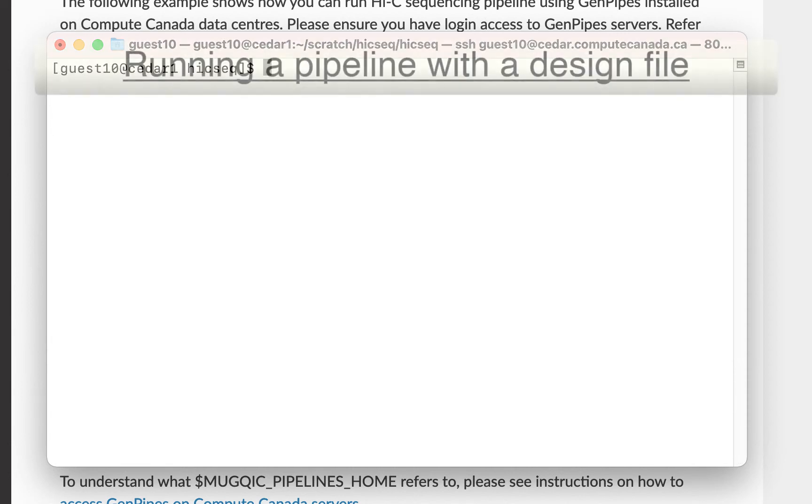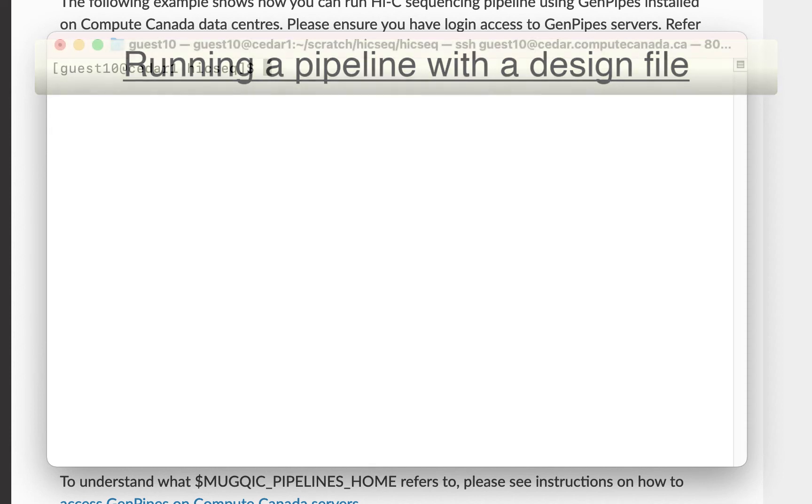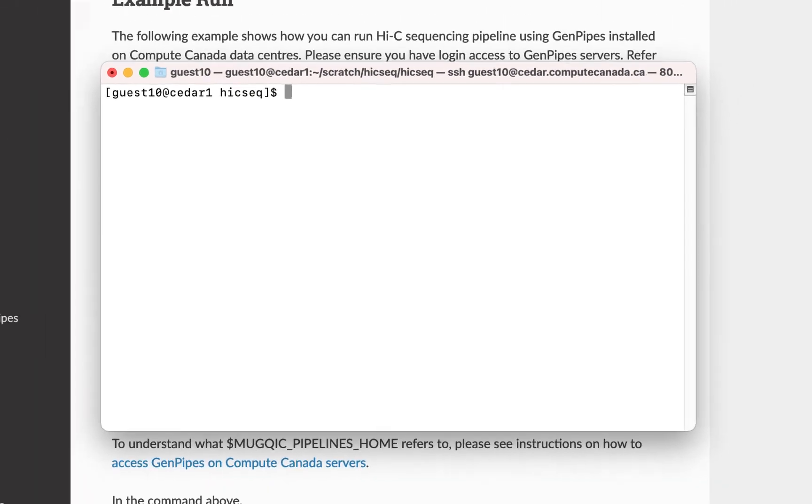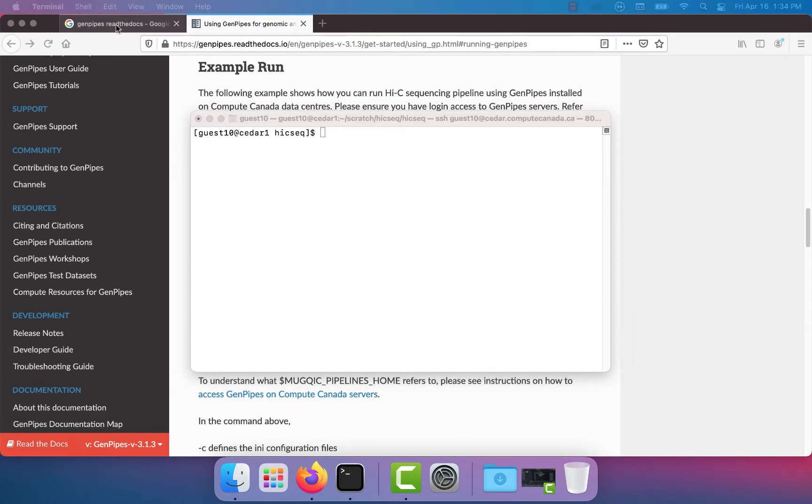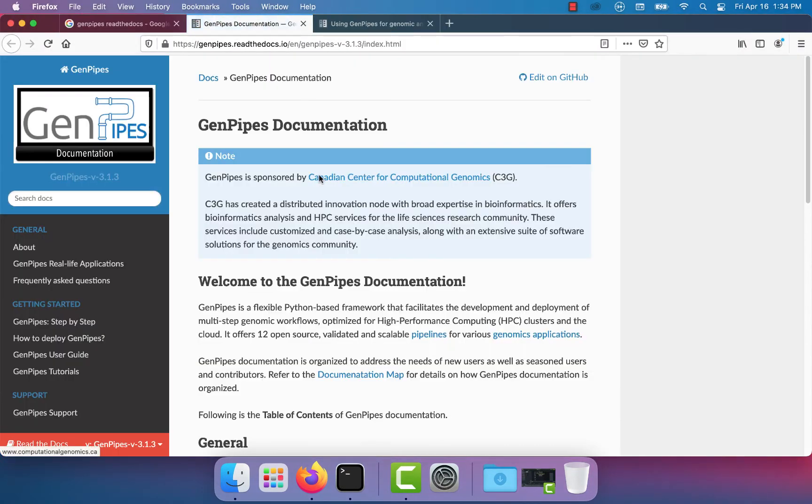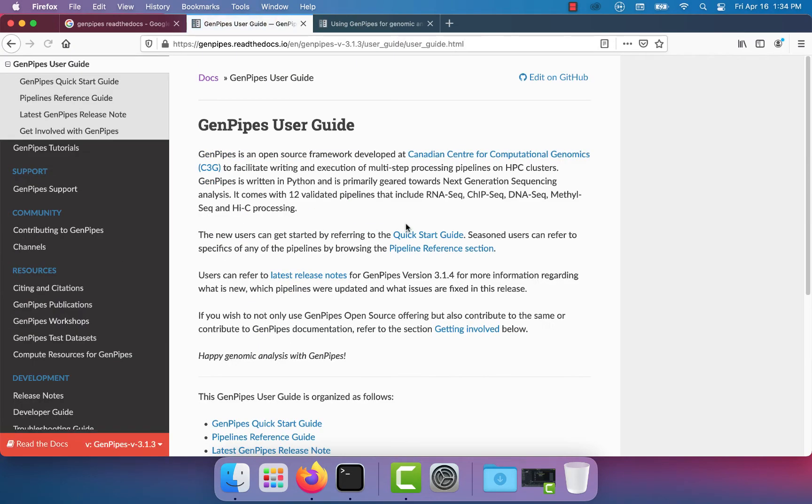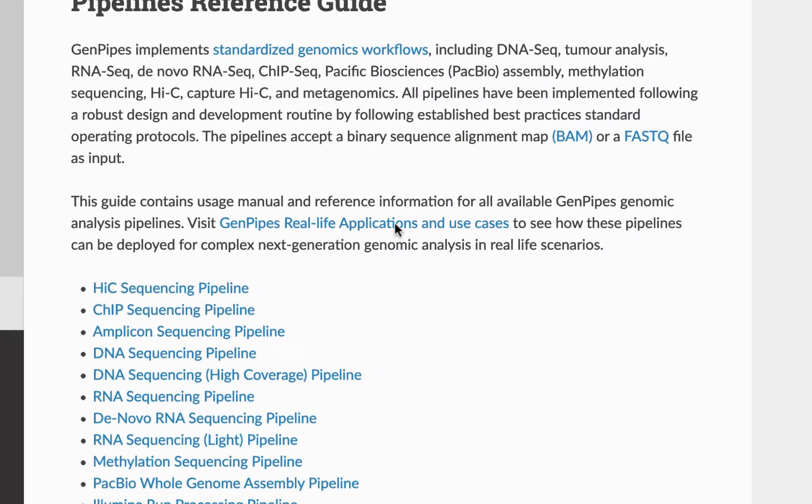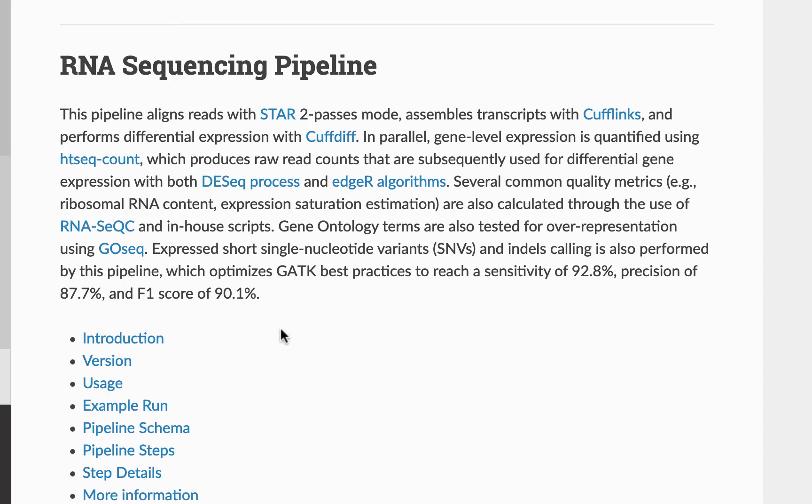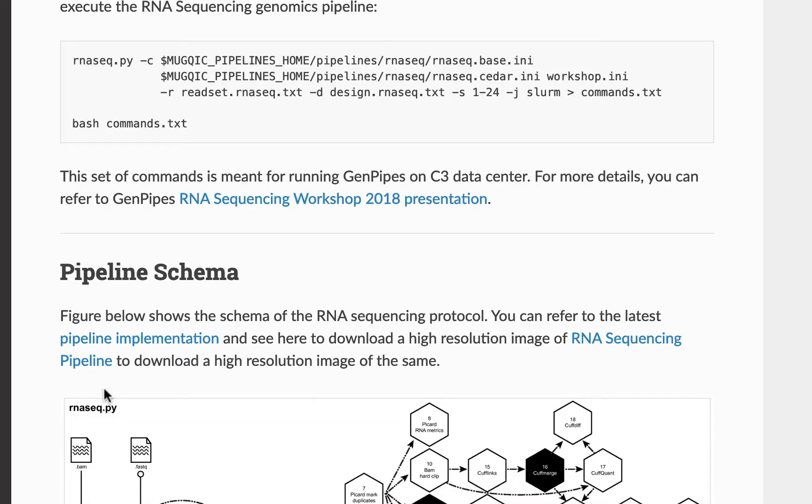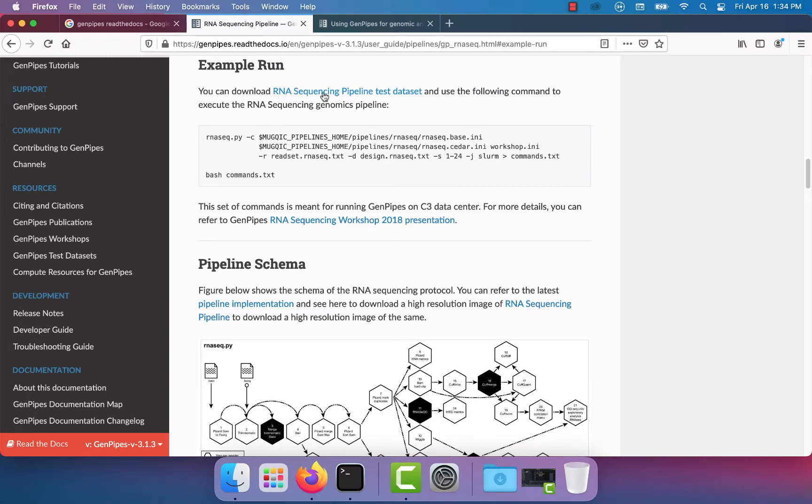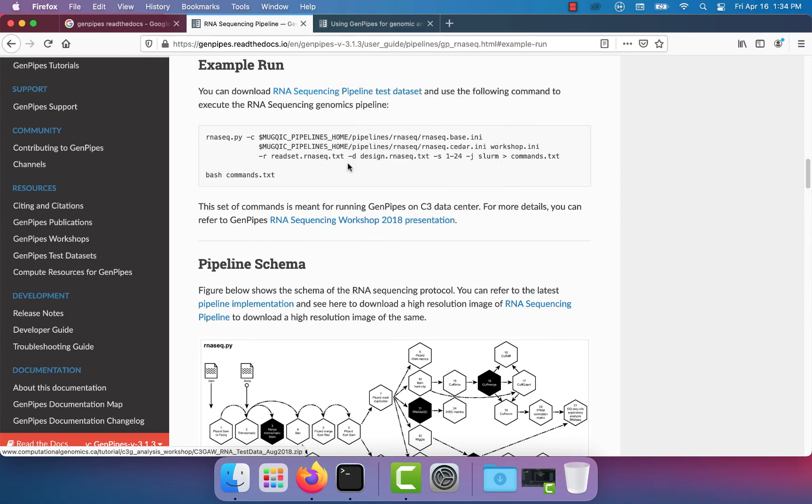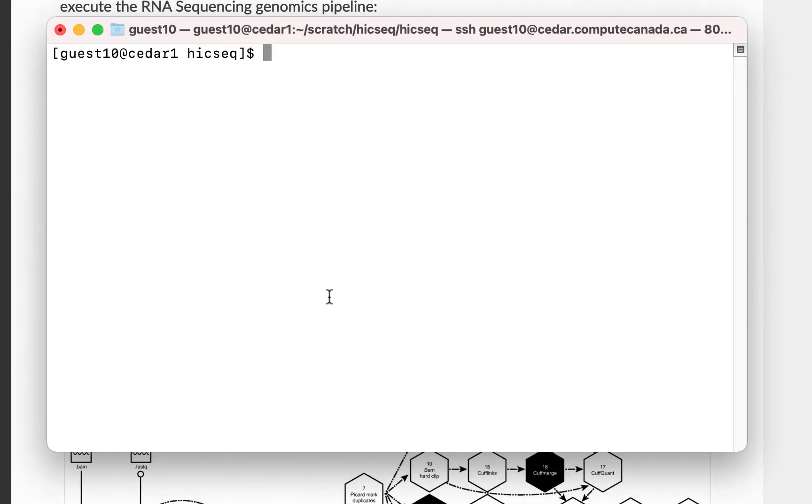Next, let's run a pipeline with a design file. For that, let's follow the instructions in the GenPipes documentation. Go to the GenPipes documentation and click on the GenPipes user guide. Click on pipeline reference guide. We are going to run the RNA sequencing pipeline. Click on example run. Download the test dataset and unzip the data file.